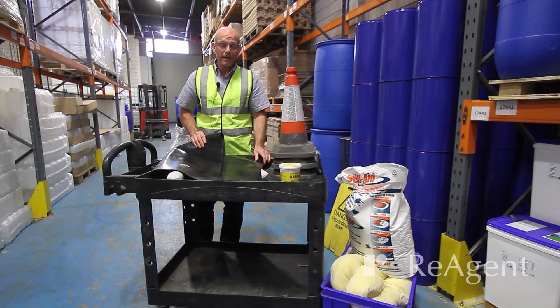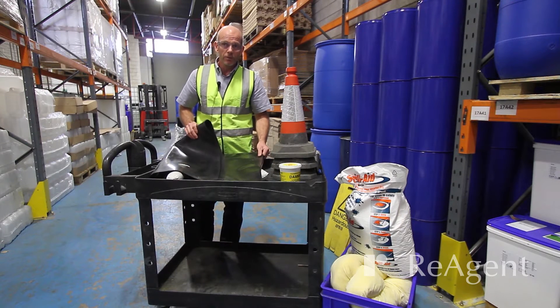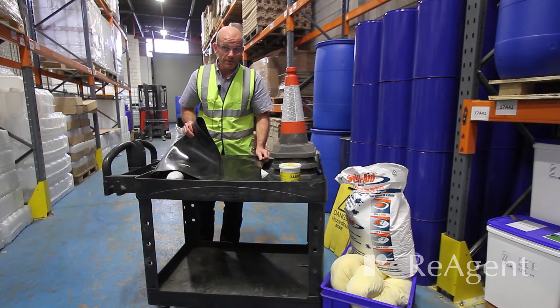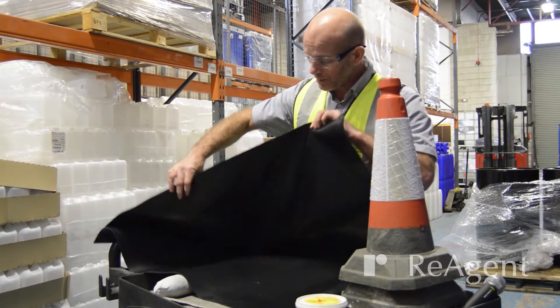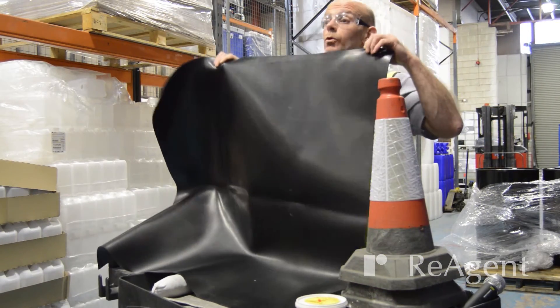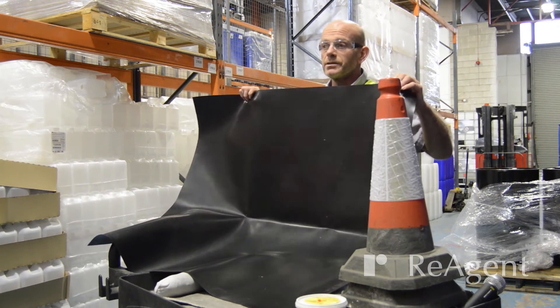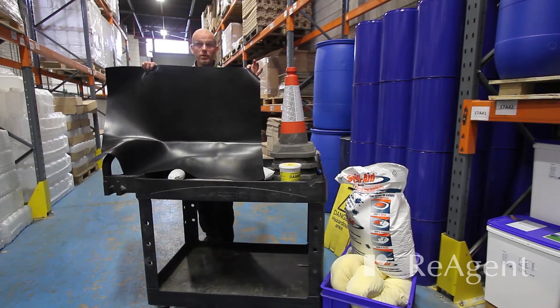This is a rubber mat — it's actually a drain cover. If liquid is spilled near a drain, we don't want it to enter the drain. You simply fold it out — it's about a metre square — and place it over the drain. That should prevent any liquid from going into the drains, so it's another useful piece of equipment.